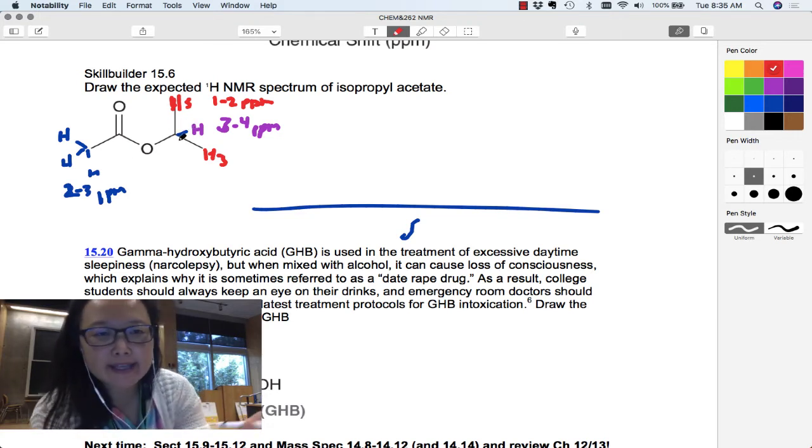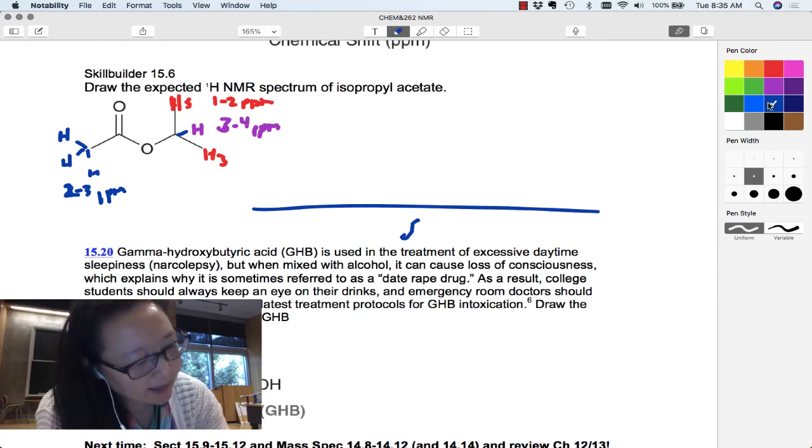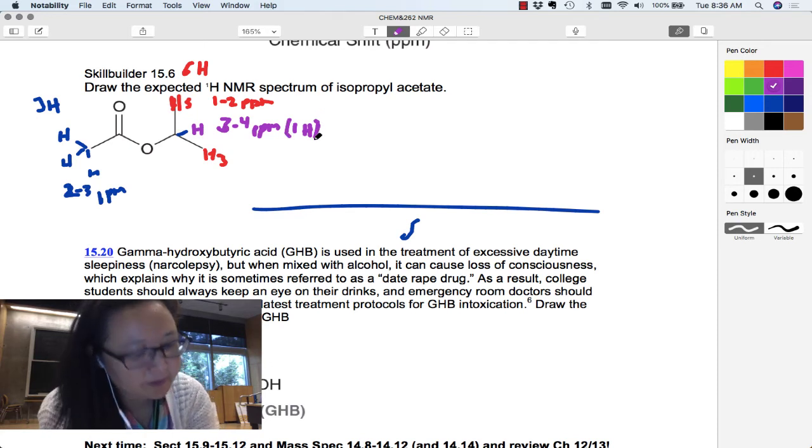Where do they appear on the axis or in the spectrum? And then the next thing we learned was about the integration. So I should see a 3H integration if it's provided. It's not always provided. I should see a 6H integration because of the two methyl groups.